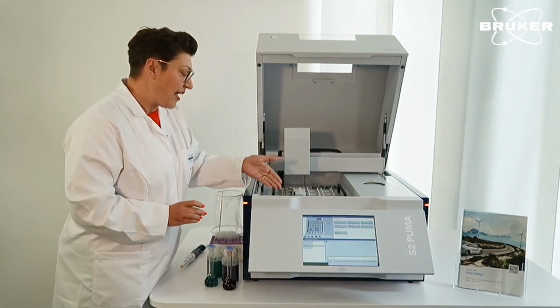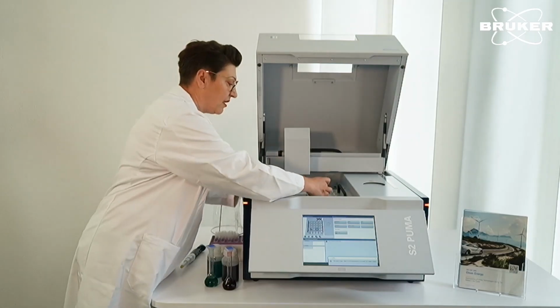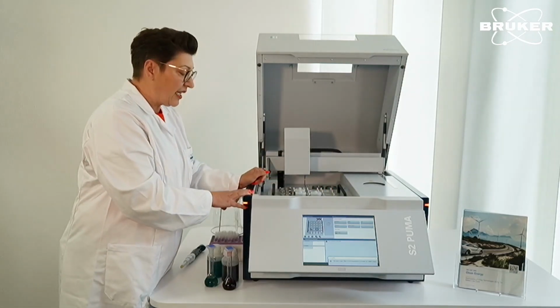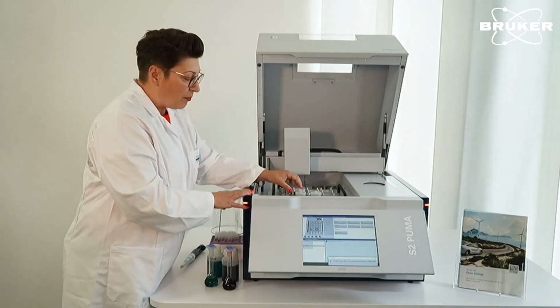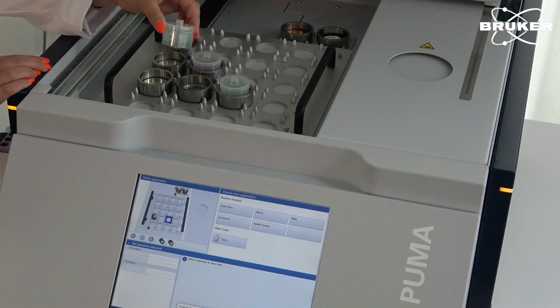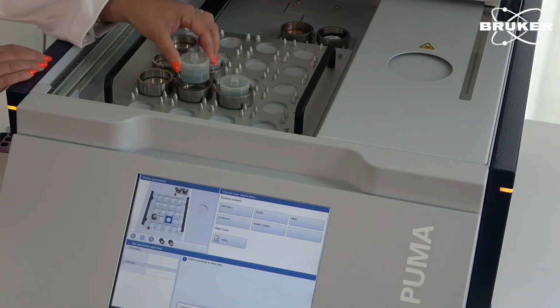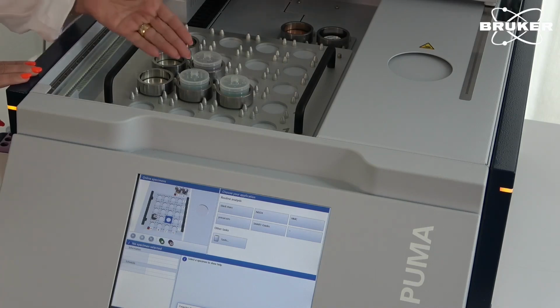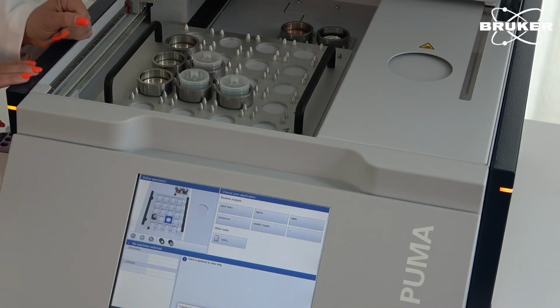So this is the loader area. So the sample is just set into position. Here you can load different kinds of samples. So powder samples or liquid samples are analyzed in this liquid cup. So typically the elements are quite heavy, like copper or nickel or manganese. So you can run the samples under air mode. The same for the powders.